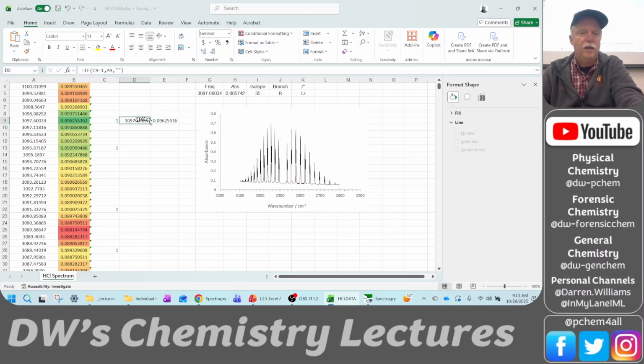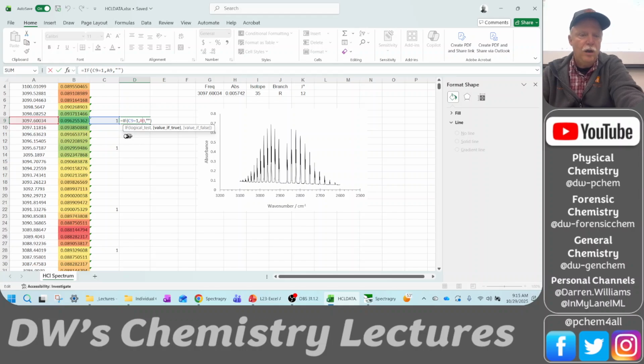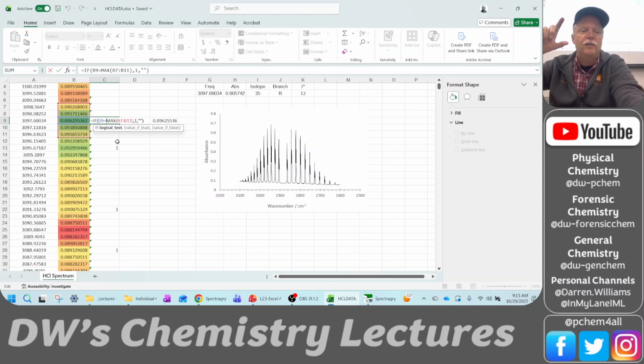What was the if parameter that you put in there? Because you were showing how some of the ones that are red still show a 1. So what was that parameter that you put so that you would only get the maximum? Yeah, it's the max formula, and I'm just using a range of 5.